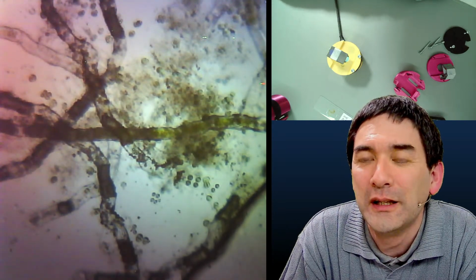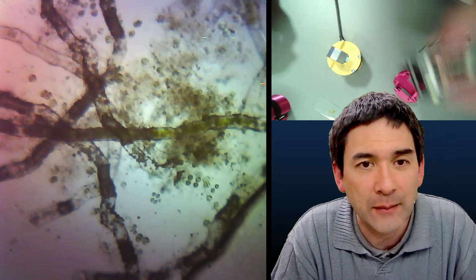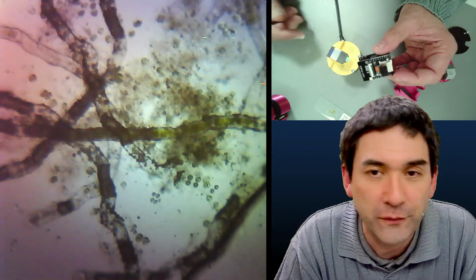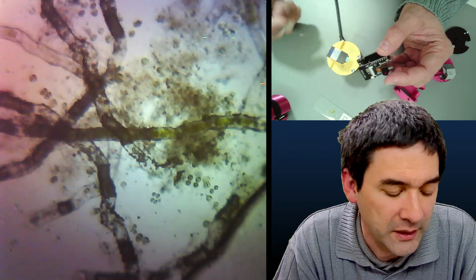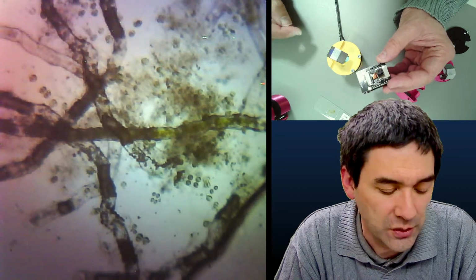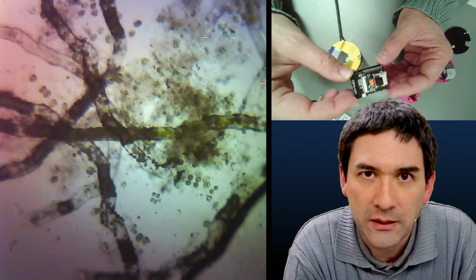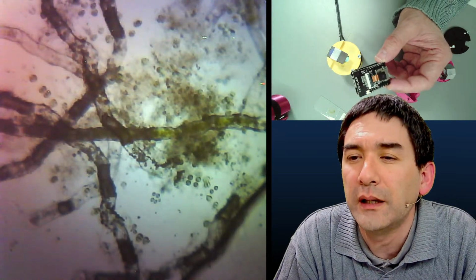This is cool. As I mentioned already, if you want to have a full documentation of this camera, there are plenty of things online that actually show how this can be configured and programmed. And if you even want to do something like programming, it's not necessary, but it's possible. And I also included a link. So it's a popular standard camera module that can be easily obtained pretty much everywhere.